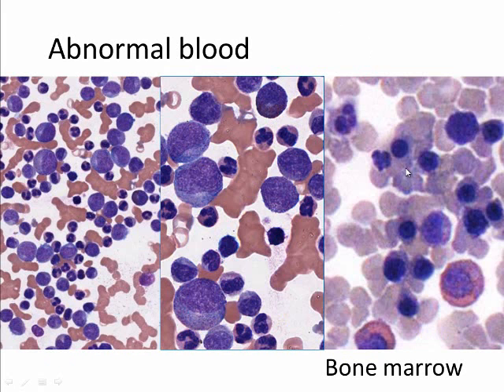And so if we look at abnormal blood, first of all, you see there's lots of blue. Here we've got the red blood cells here and here and here, and these are the neutrophils, lots of neutrophils. But we also see some where the chromatin is not as condensed as in the mature cells, and we even see some that are very big. What a whopper! So you have large cells with a large, light-staining nucleus as opposed to a dense-staining one.